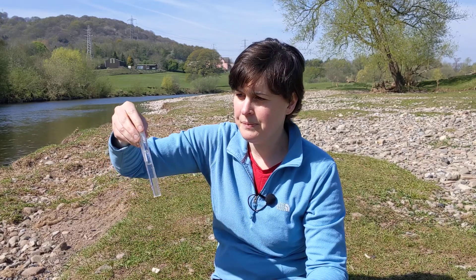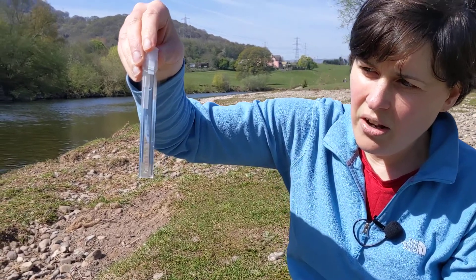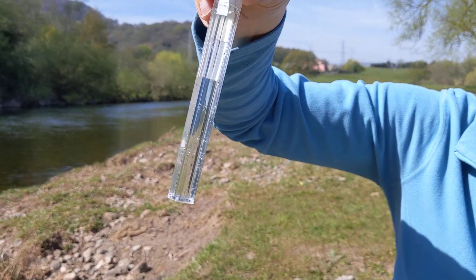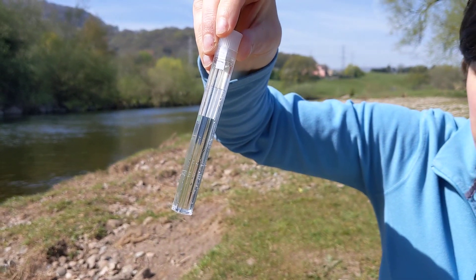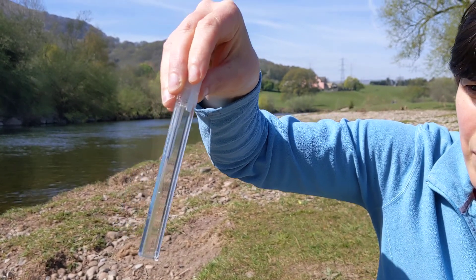Once you've done it five times, you might notice the water start to change colour. This might be a bit tricky to see because I'm wearing a blue top, so if you are wearing something blue try and hold the sample away from you.